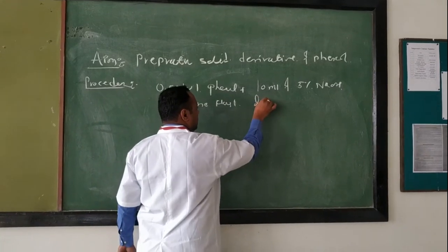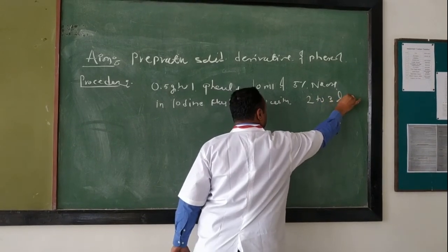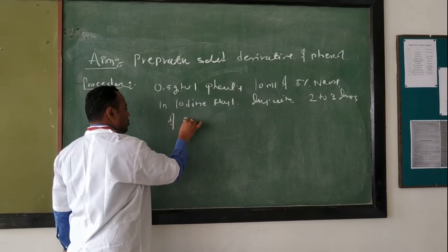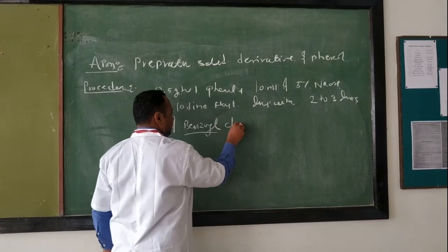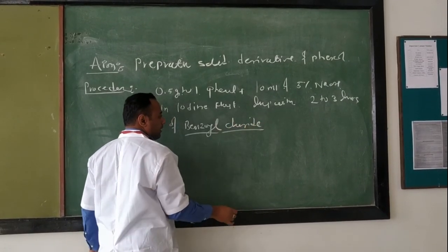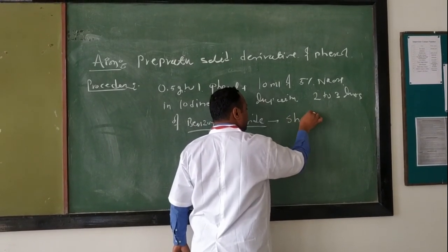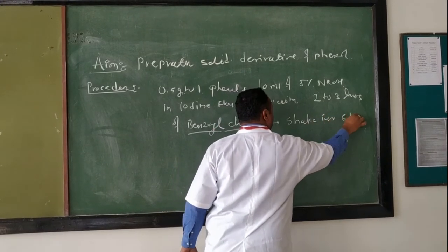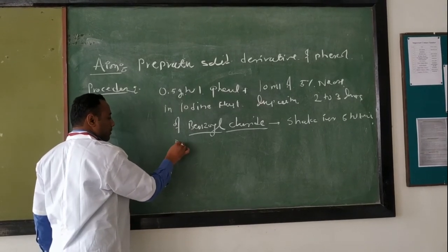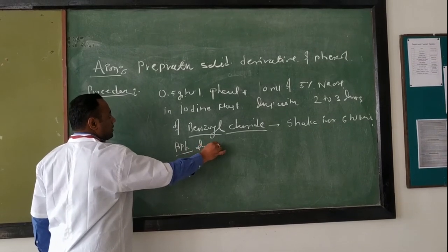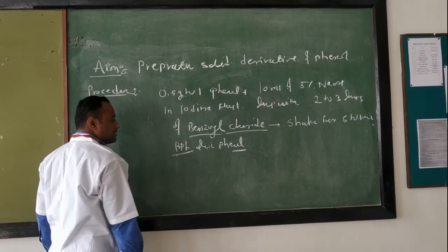Dropwise, you have to add 2 to 3 drops of benzoyl chloride. Make it clear, benzoyl chloride, not benzoyl chloride. It is benzoyl chloride. After adding this benzoyl chloride, shake this flask for 5 to 10 minutes. You get the product or precipitate of derivative of this phenol. Filter this and wash it with water and take out the melting point.